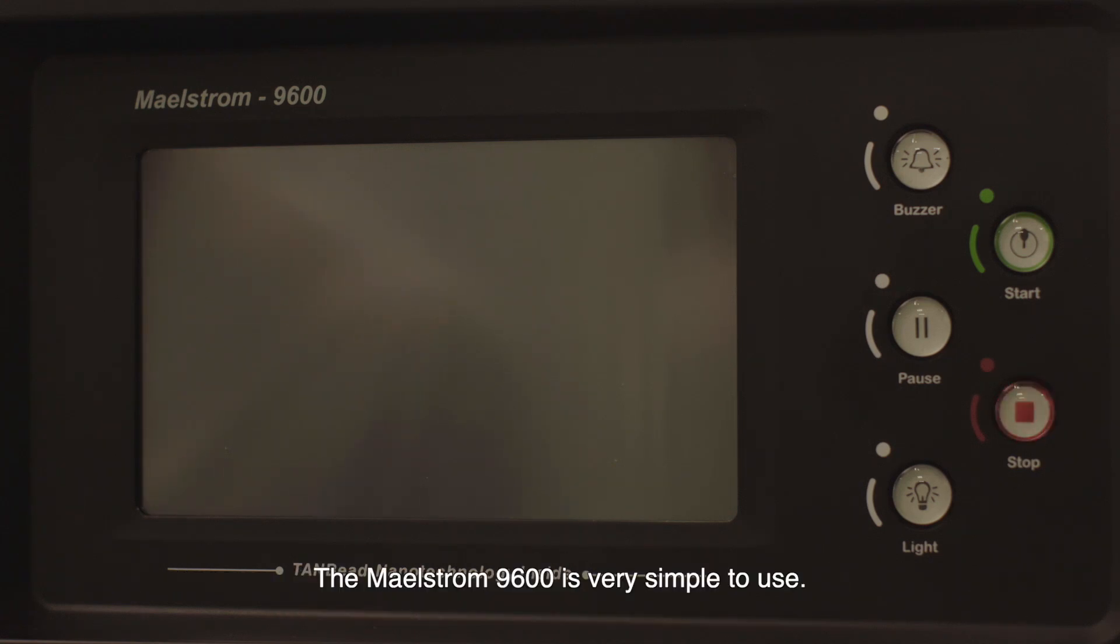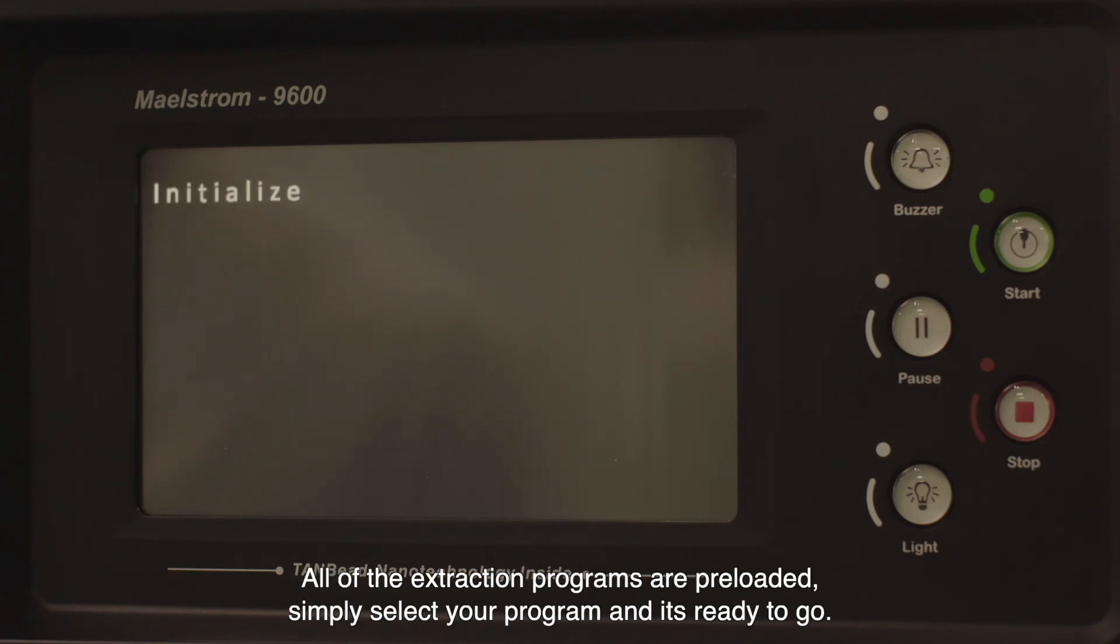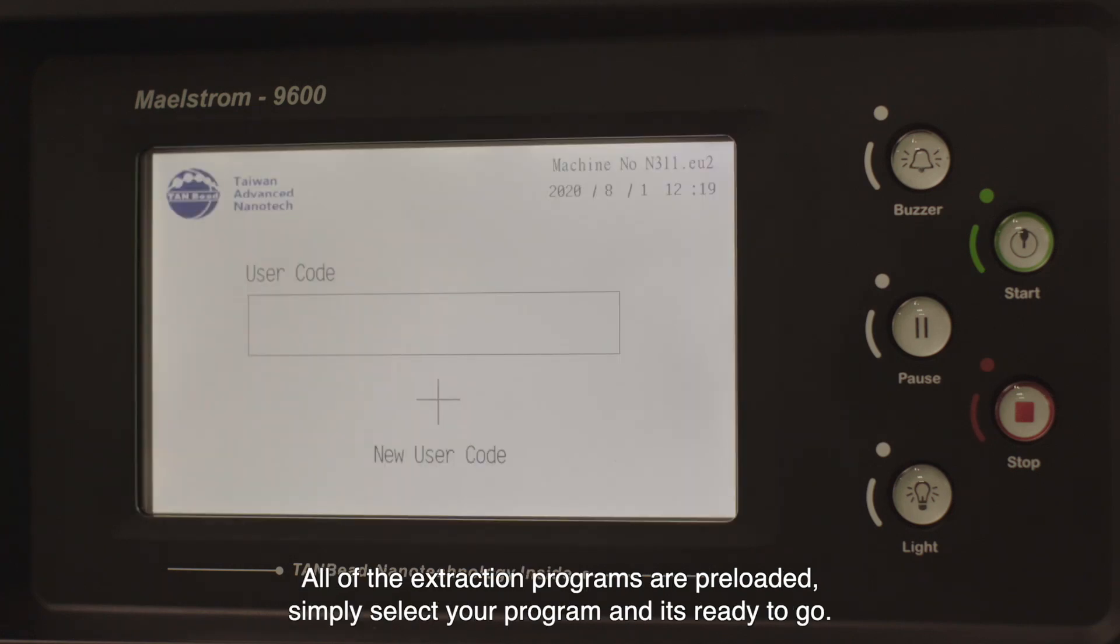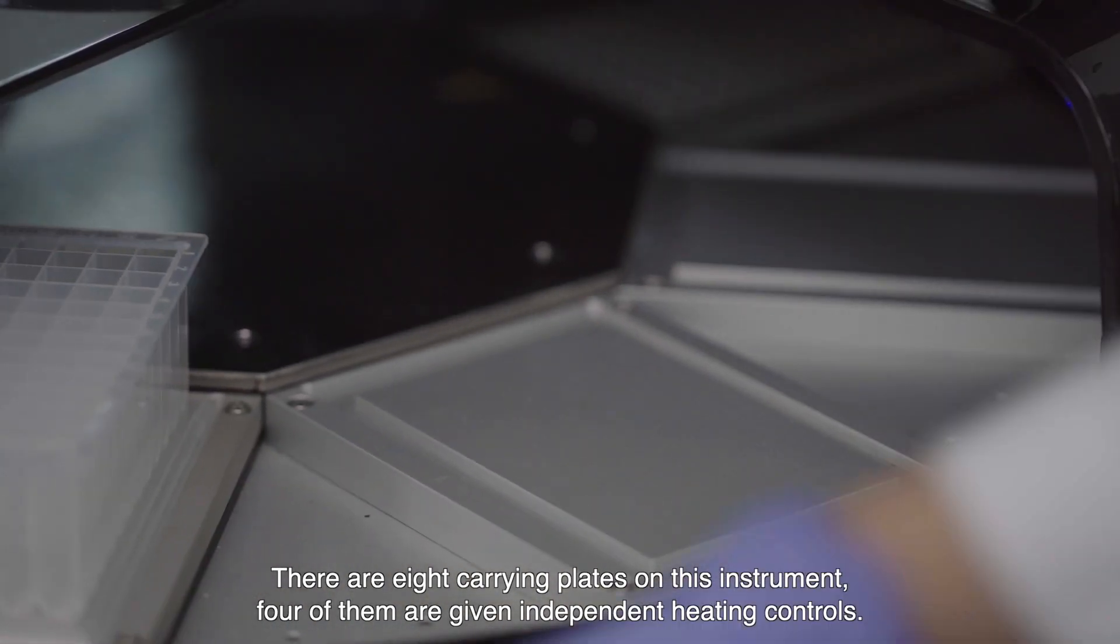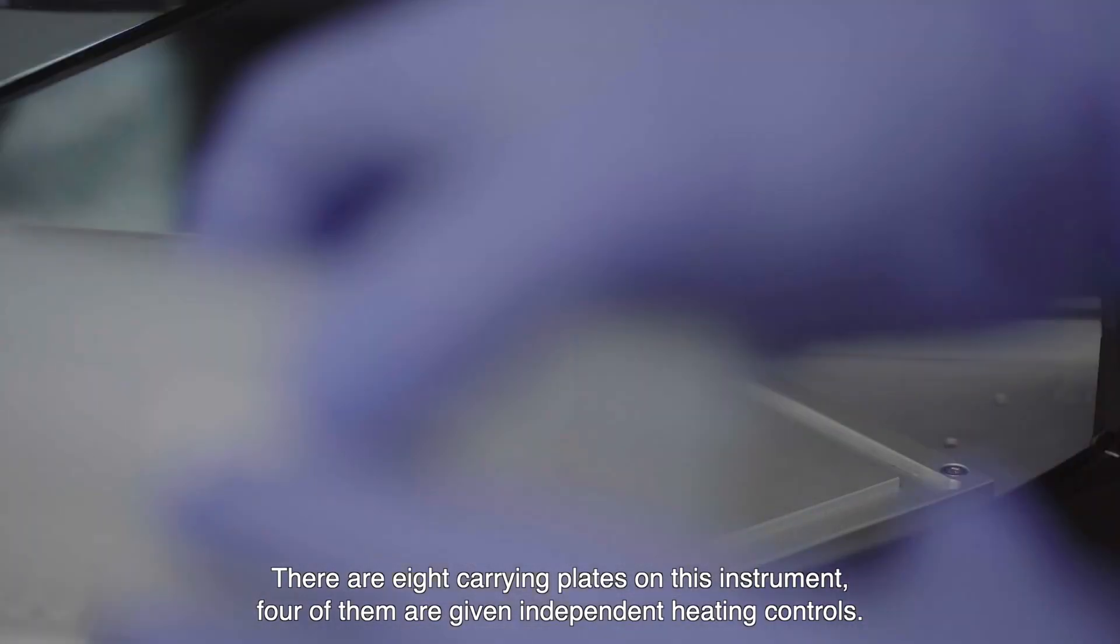The Maelstrom 9600 is very simple to use. All of the extraction programs are pre-loaded. Simply select your program and it is ready to go. There are eight carrying plates on this instrument. Four of them are given independent heating controls.